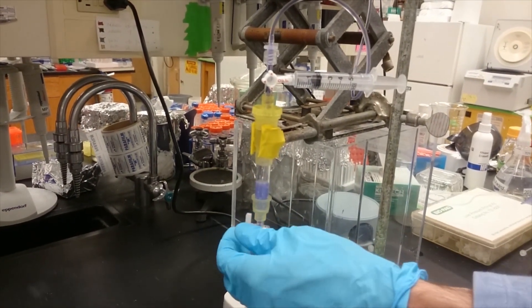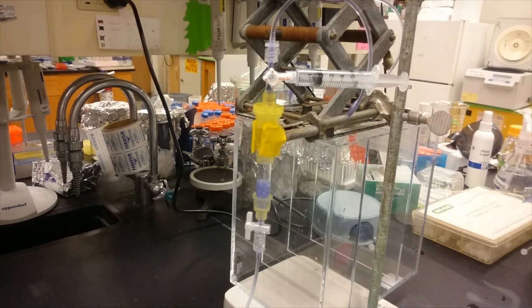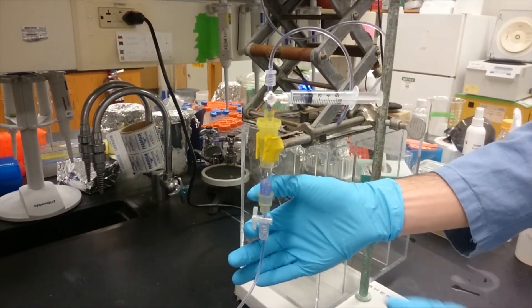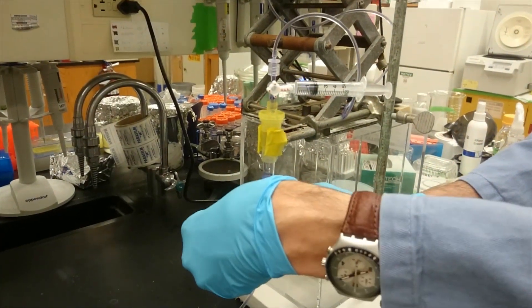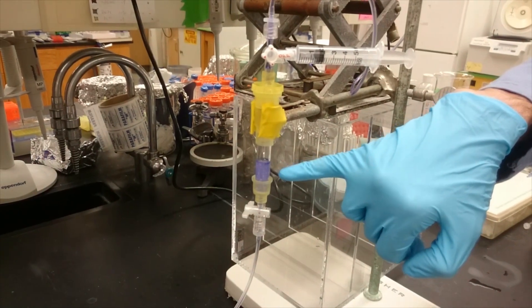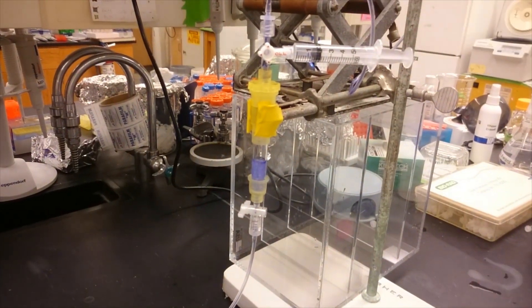If I let it run again and bring the solvent reservoir back to not so tall, and then close this, you can see that the amount that builds up on top is a lot shorter, because the distance now between these two is a lot less.